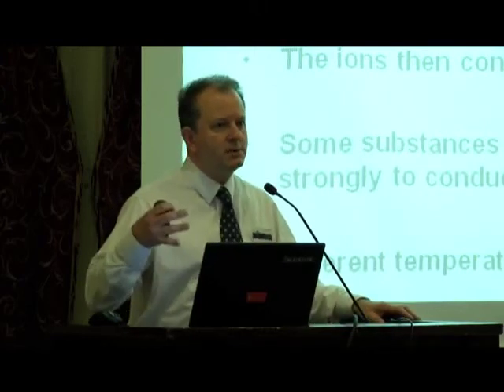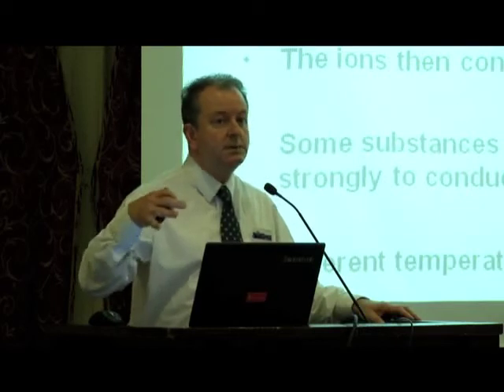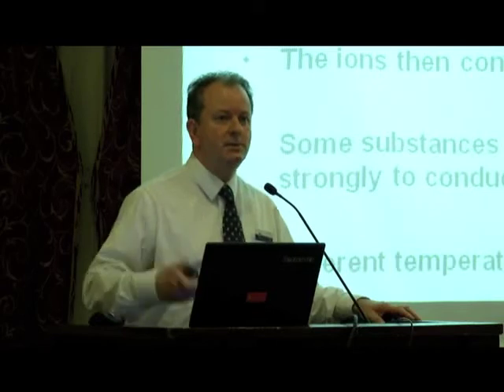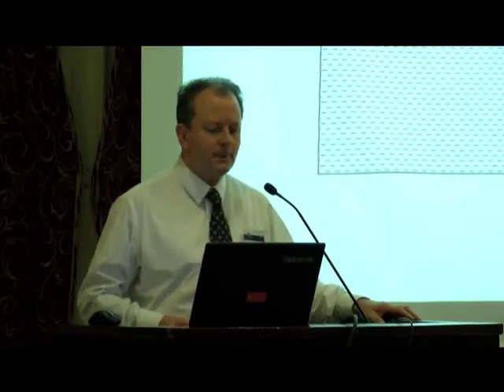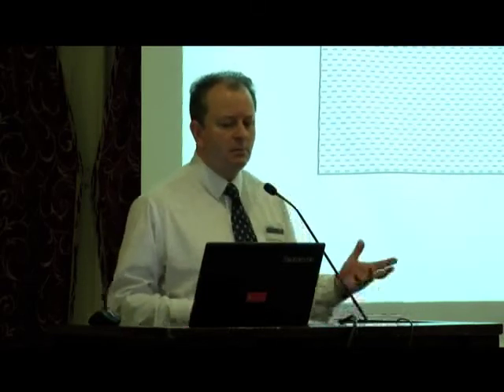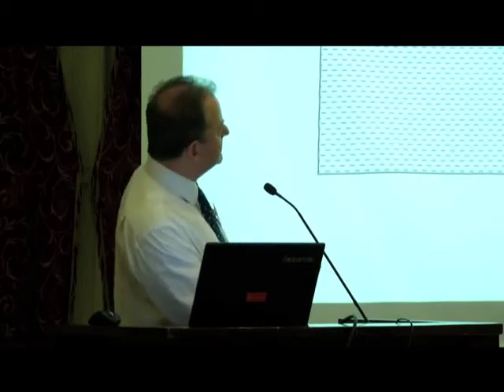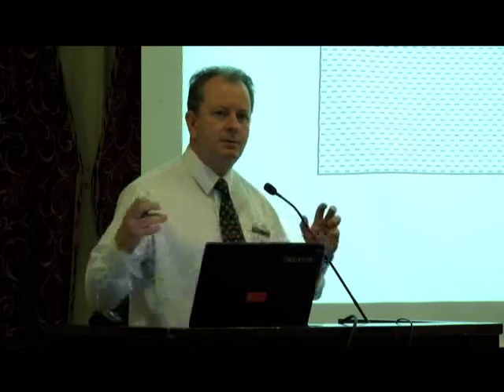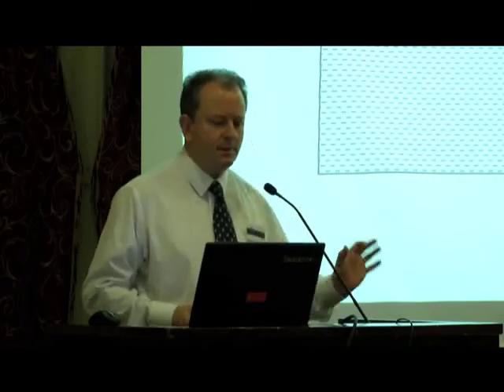So when you are measuring conductivity, you need to understand what is in the water to make the measurement correctly. So a conductivity meter will measure these ions as they go through the water, and they carry an electrical current in the water. So this dissociation is the key factor.